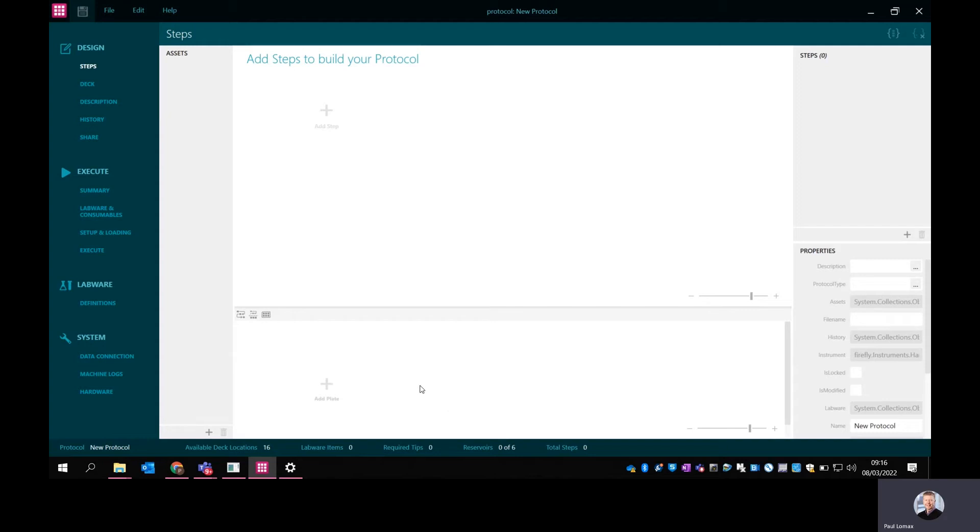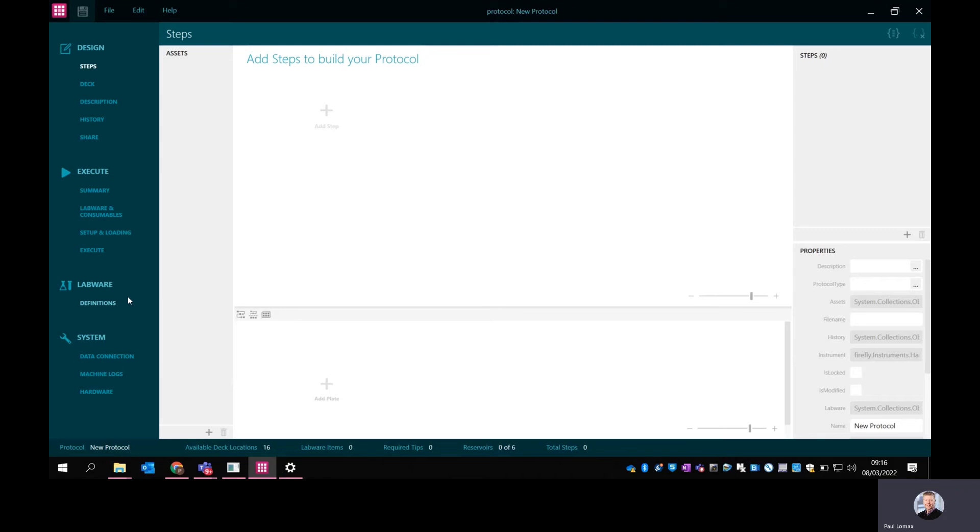The screen that you see here is the design screen. If you look down this left panel here, there's two main sections: design and execute. Design is the part around building a protocol and execute around running that. We've also got lab where we can put labware definitions in, and a system area for service and diagnostics.